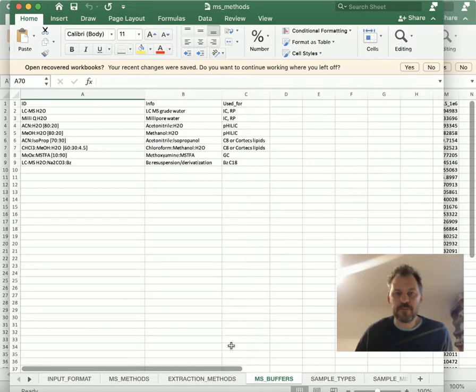where I imagine you can just edit, and if something changes or you've got a new method. So this work will be something you won't need to do every time you run the converter, but it's something that's available to you in case the methods that are already here in the list are not sufficient.